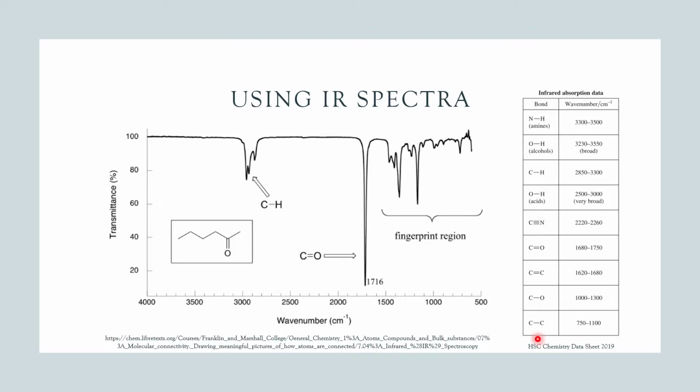We're expecting to see something because there are carbon-carbon and carbon-hydrogen bonds that are present in this region, and that's completely fine. But really, the only way that any of this data in the spectra could be useful is if a computer was able to match the spectra that we got to a database that already exists that shows essentially, again, that fingerprint for each different kind of molecule. And we could possibly use that then to identify the molecule that was scanned, but not something that we're going to be doing in this course.